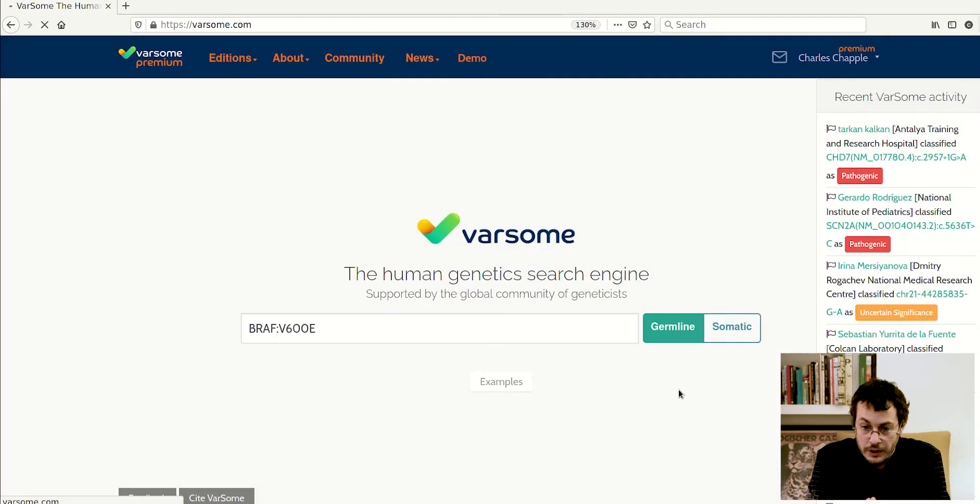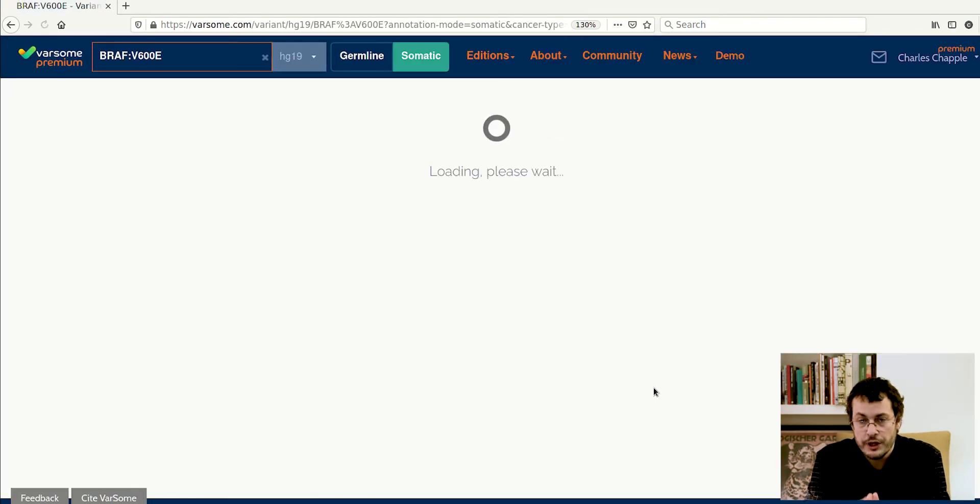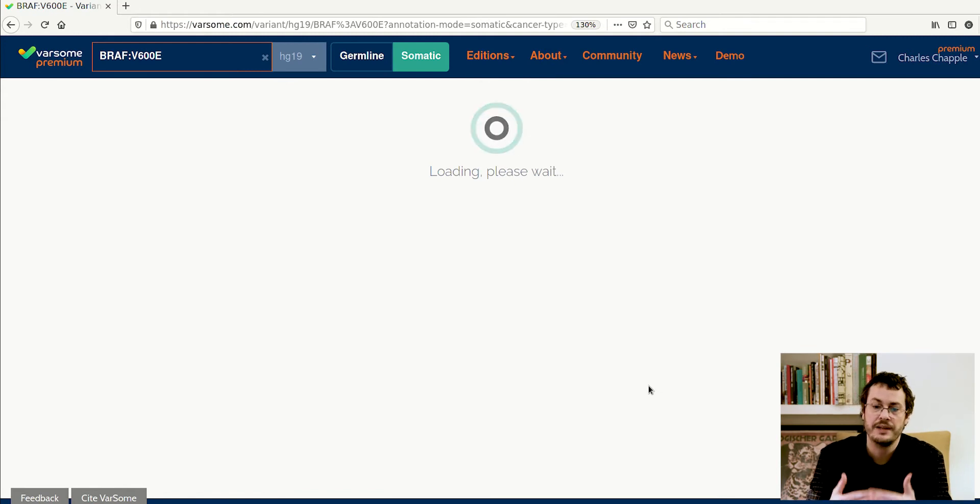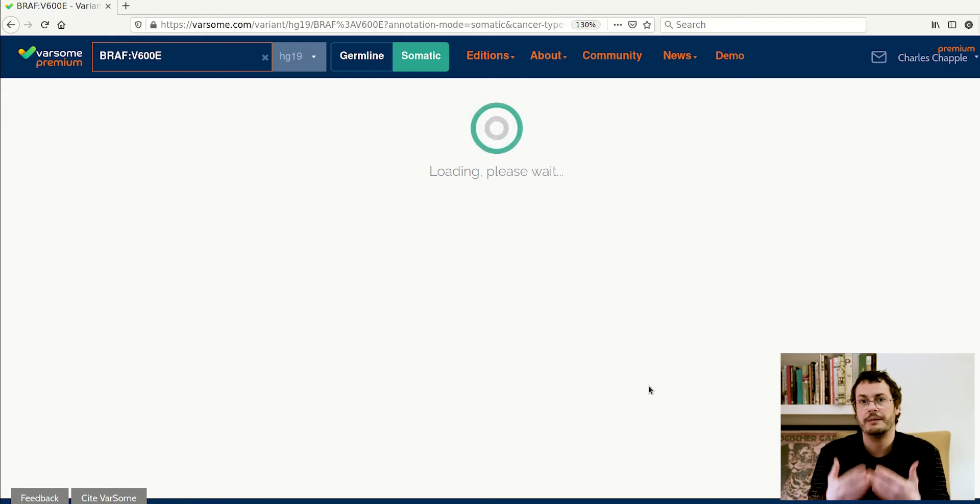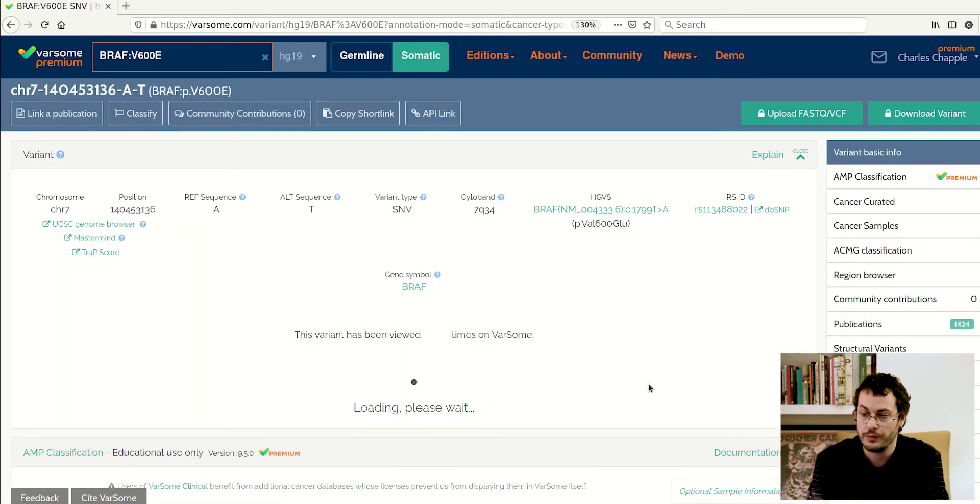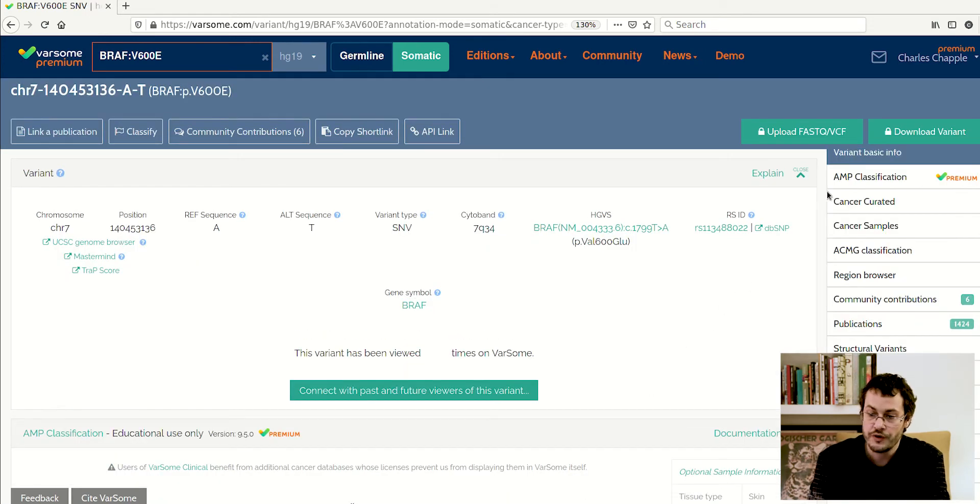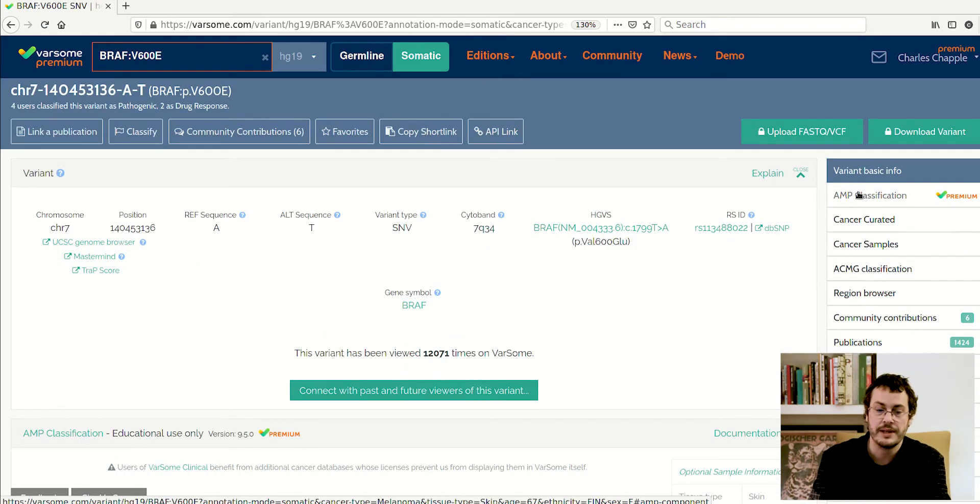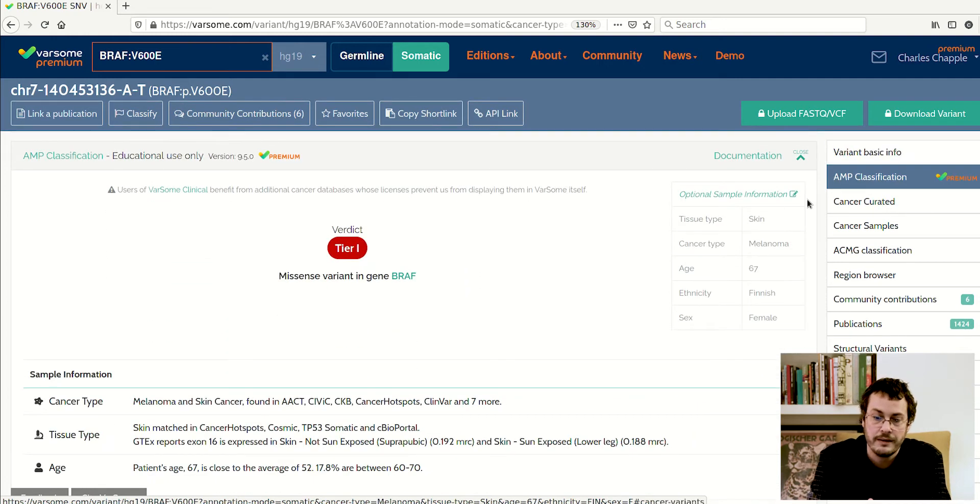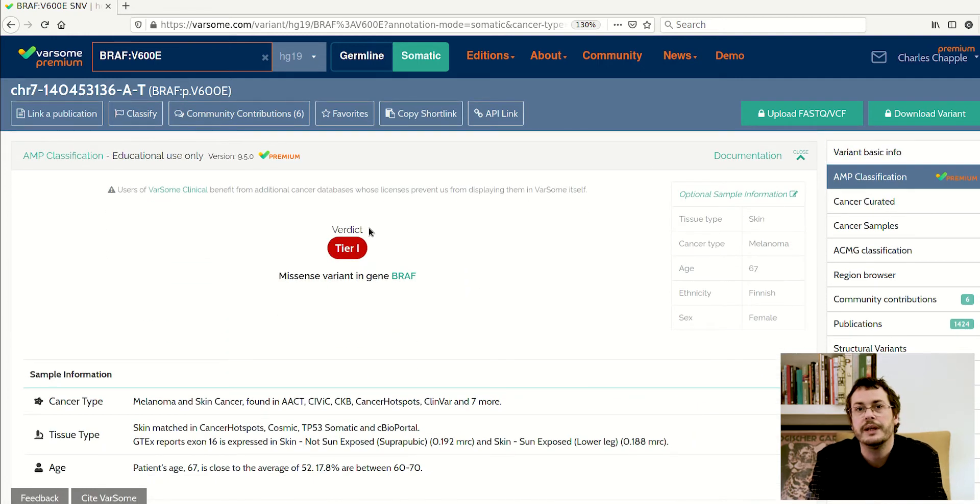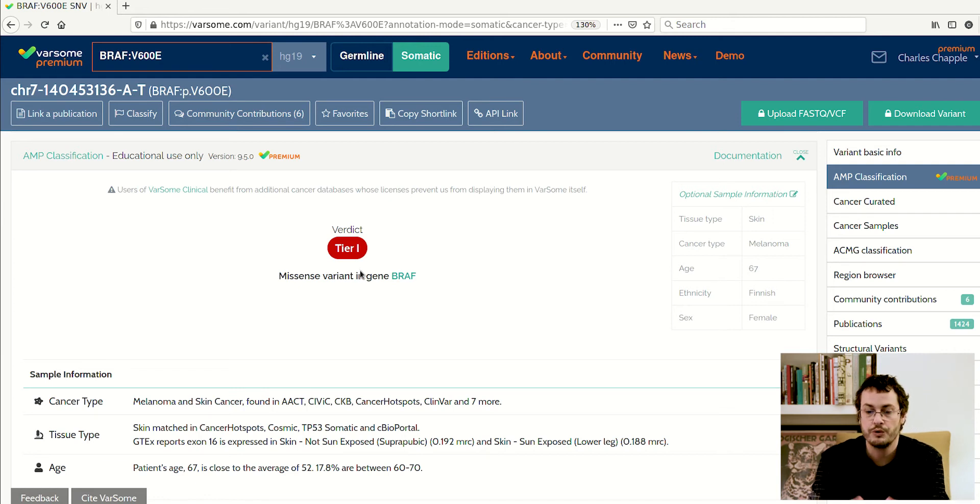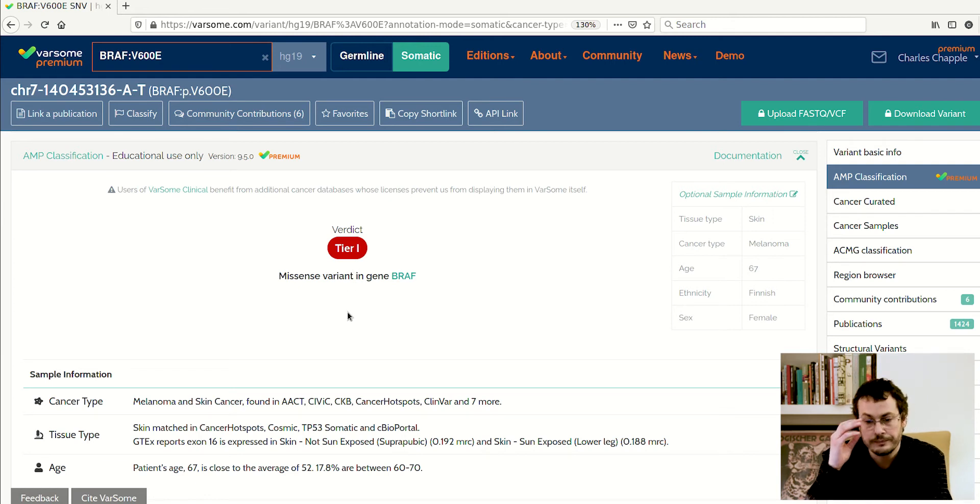Now when you search, you will see all of the normal information we have in Varsom, but now you will have these additional AMP relevant and somatic modules included. First of all, what we have is the AMP classification, and this is the final verdict we have given for this variant. In this case, we have placed it in tier one. That is the most clinically relevant category of variant.